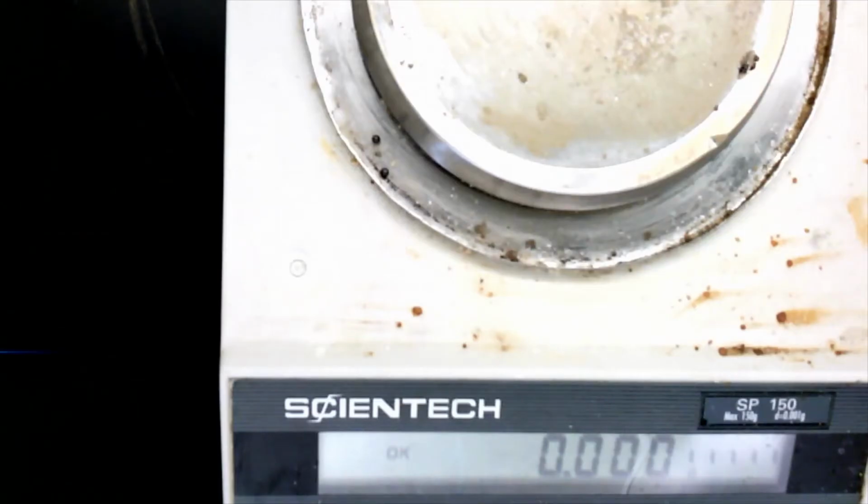Welcome to the second virtual lab. I'm going to be doing the empirical formula experiment. So we're going to be applying some of the things we talked about in class, of how we can look at experimental data. If we can calculate the mass of all the elements, or the mass percentage, that would work too, of all the elements in a compound, we can calculate its empirical formula.